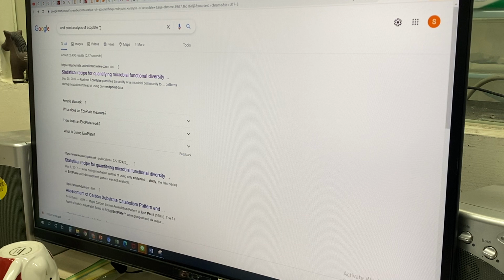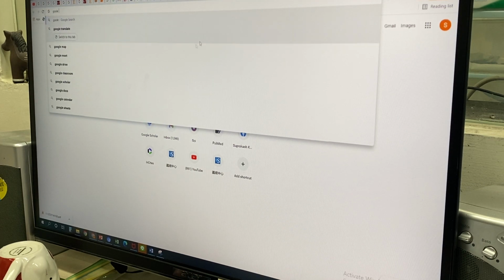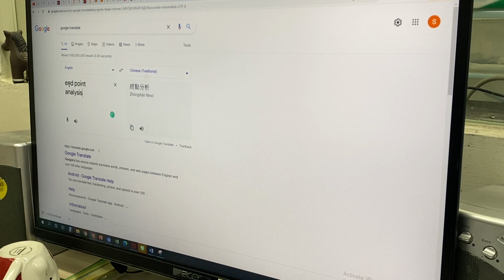I'll show you. Okay. So this is your endpoint analysis.